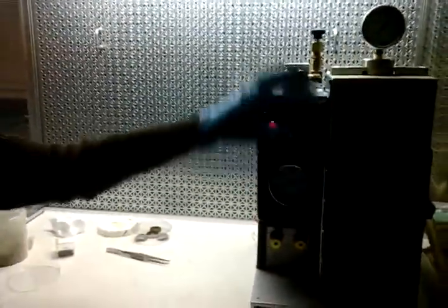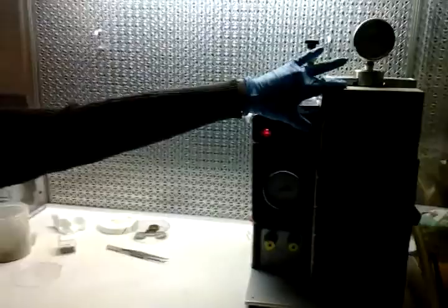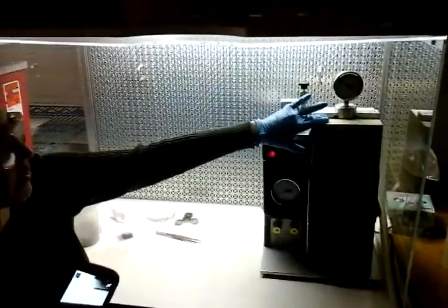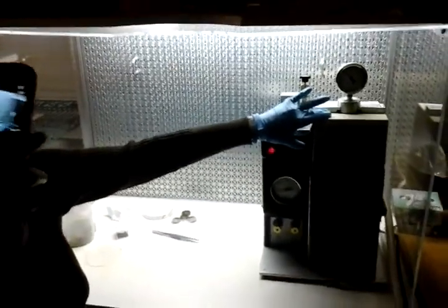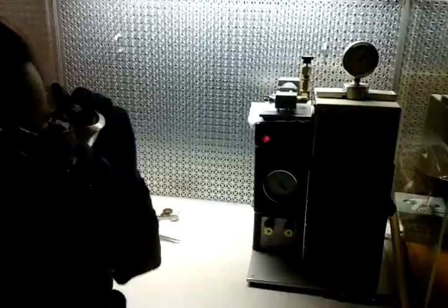Now we're going to shoot. This gauge up here is going to show the pressure of helium. At around 1,300 psi, the rupture disc will fail and then everything will go through the system. We're still generating pressure of helium behind the rupture disc — almost there. And... release.